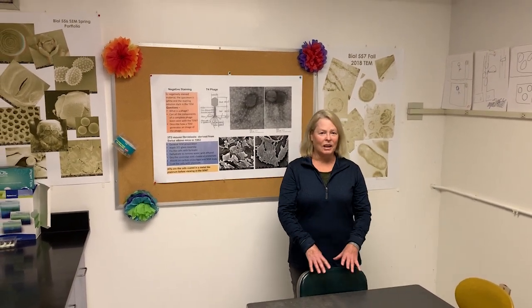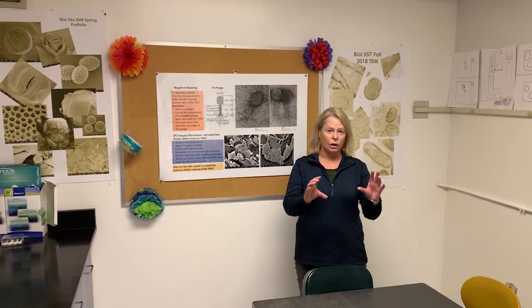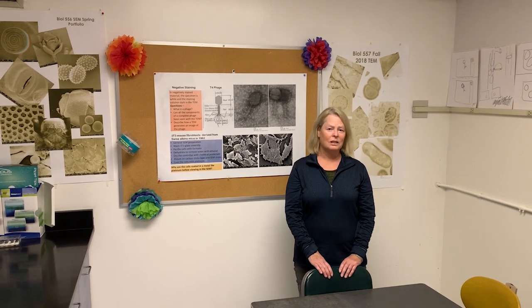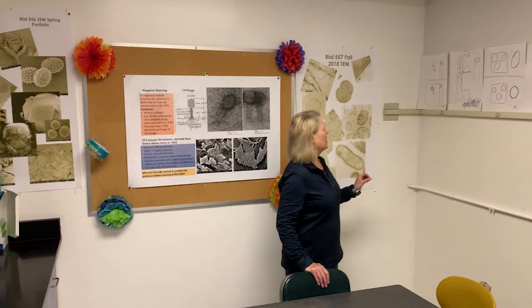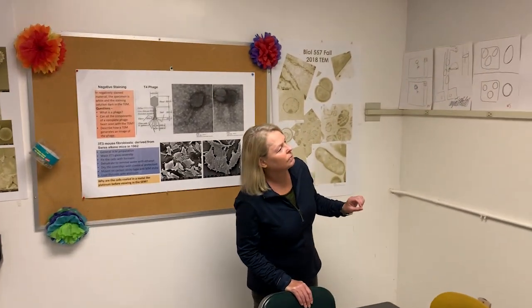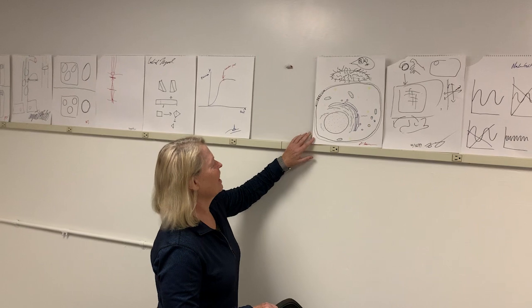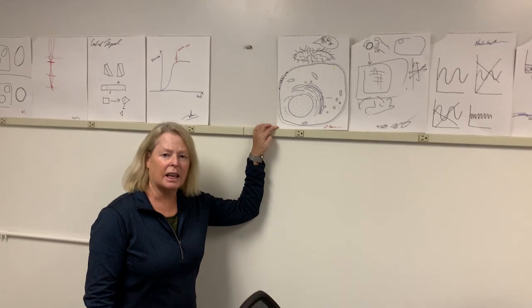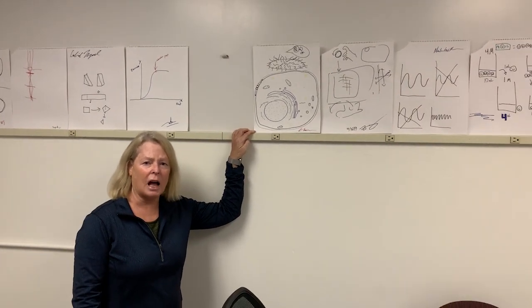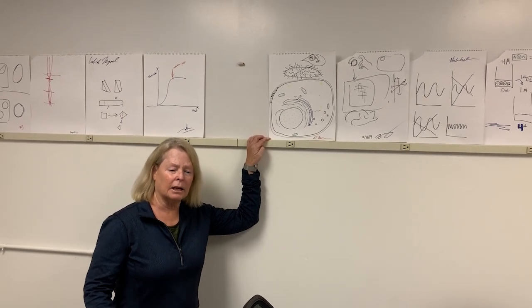Since we're all worried about viruses and everything, you've probably seen a lot of EM images along with all of the news reports. The one thing I want to show you is why EM is so powerful. To do that, we will use this one. One of the things our students had to figure out: what we do in EM is we want to figure out what the term scale means. And that refers to sizes of entities and how we end up looking at entities.